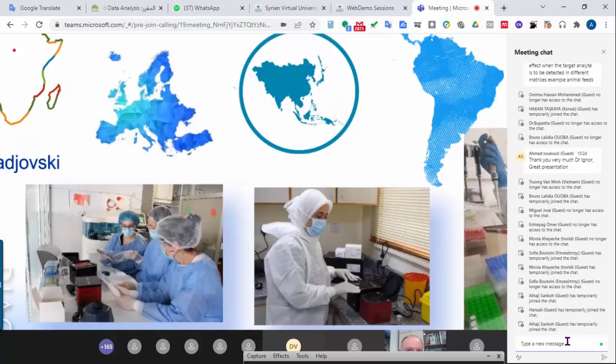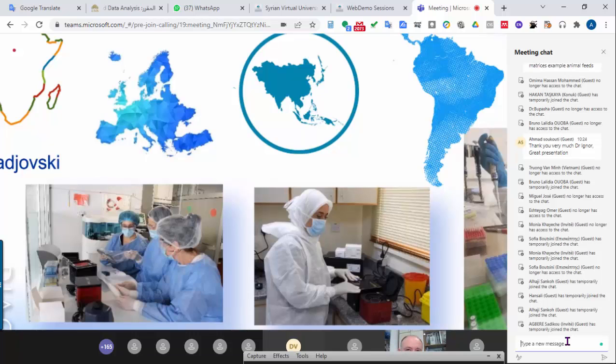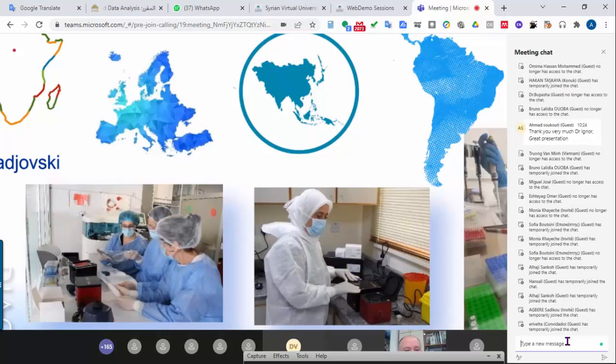But if there are data for that, then during your verification in your laboratory, just to prove that you can use this assay to test this kind of matrices, you should include in the verification study a representative sample, a reference sample from this matrix.